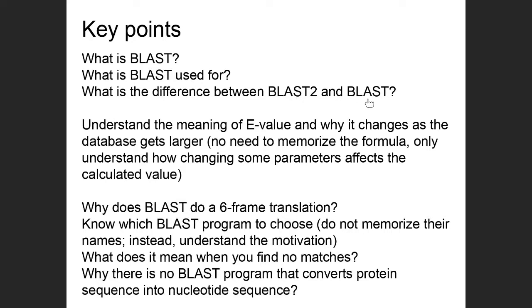But we're going to use BLAST, and what we do is we uncheck that align two sequences. So you will see how that works. This part here, and I already introduced you to this earlier, but the E value is the expect value. It's kind of a big deal to know what that means. You don't have to know how it's calculated. If you're in math, you might go like, oh, I really want to know.